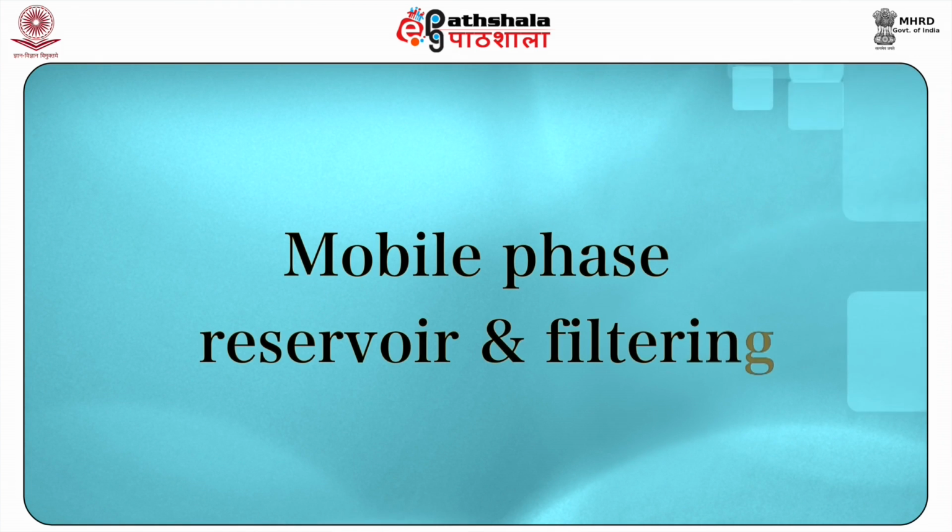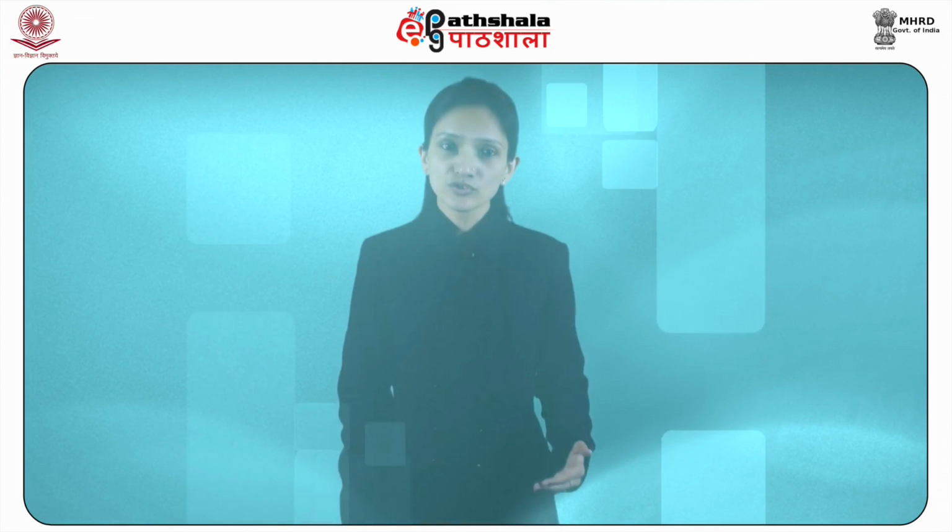Next is mobile phase reservoir and filtering. The most common type of solvent reservoir is a glass bottle. So as to remove the dissolved air, purge gas or helium is used, and Teflon tubing and filters are employed to connect it to the pump inlet.